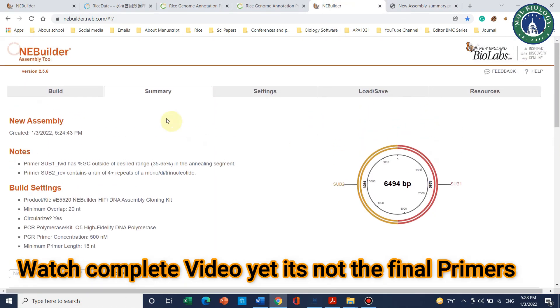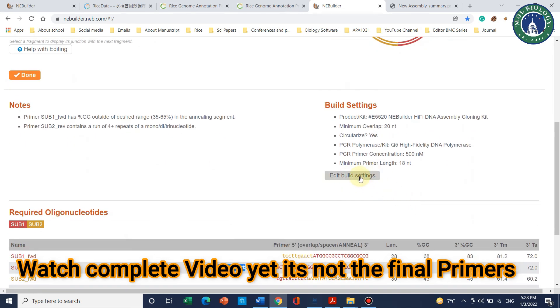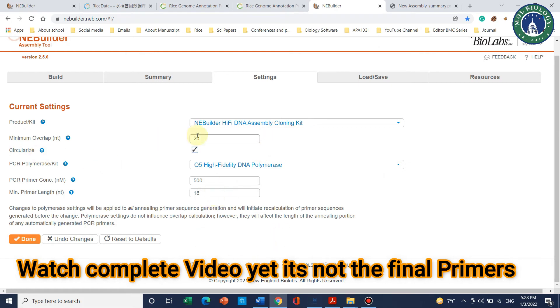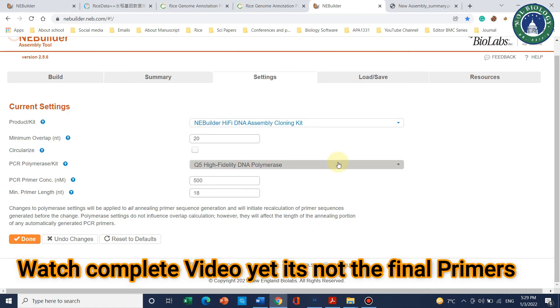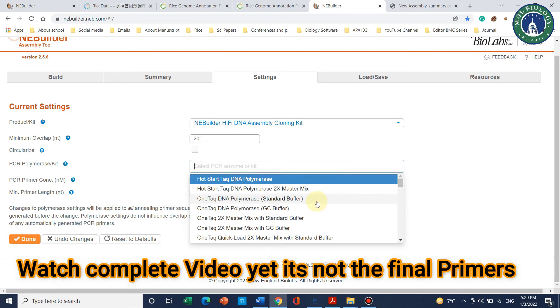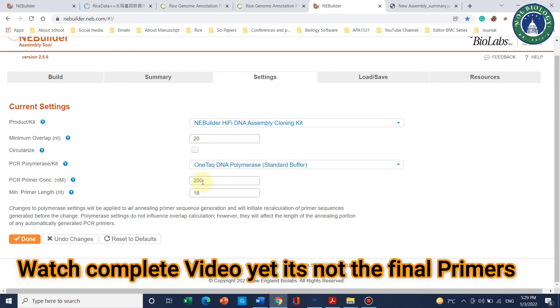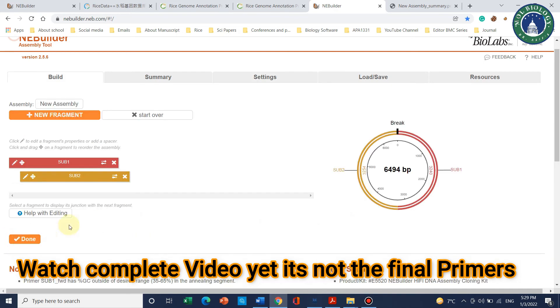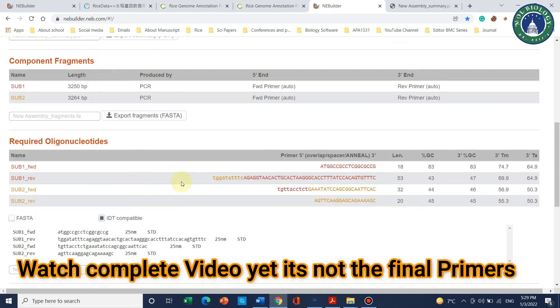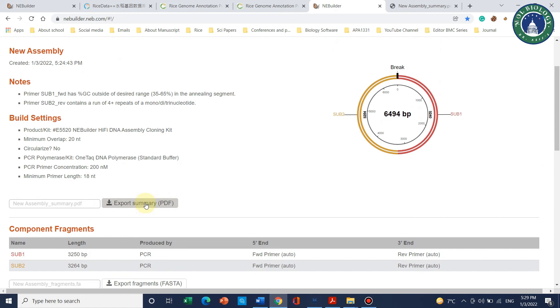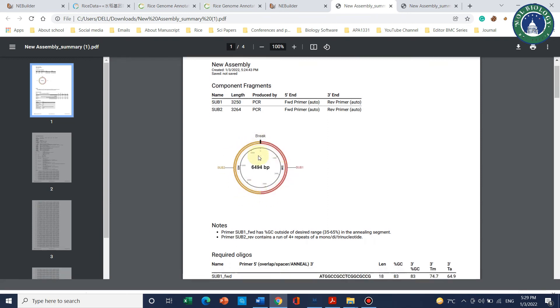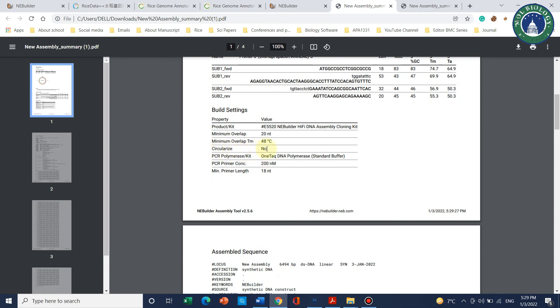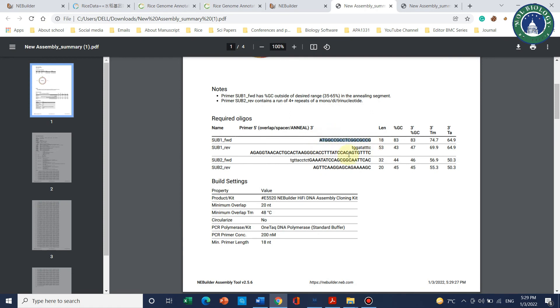Since our fragment is not circular but linear, we can go back and change the build settings. Uncheck the circular option. If you want to use a different cloning kit — for example a simple master assembly mix — or a different polymerase like Taq DNA polymerase, you can make those changes here. Leave other settings as they are and click 'Done'. A new PDF summary will download.